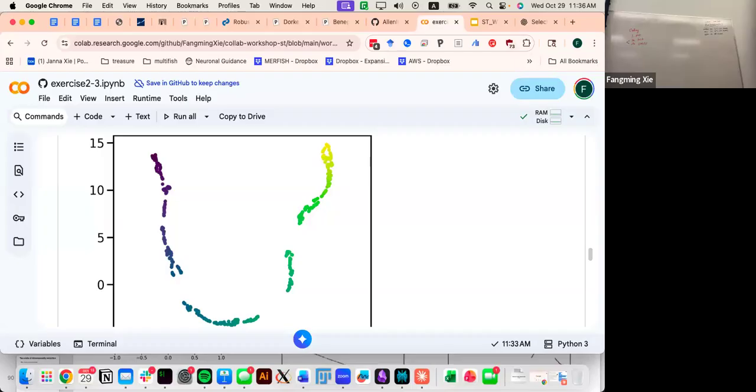Okay. That's the problem when debugging, troubleshooting takes long. You always try to run it after. Actually, we are usually impatient, and it's always good to try to run it on smaller data. So instead of running it on say 80,000 cells, let's just run it on the first 100 cells. That should be done in a few seconds. Yeah, 4 seconds. Okay, then we can see if it goes through.